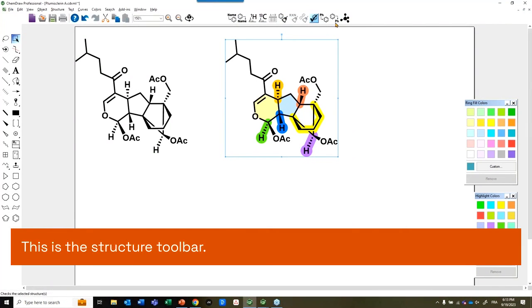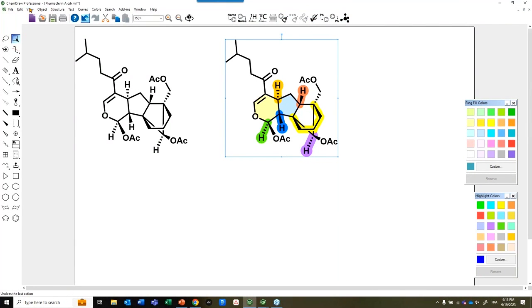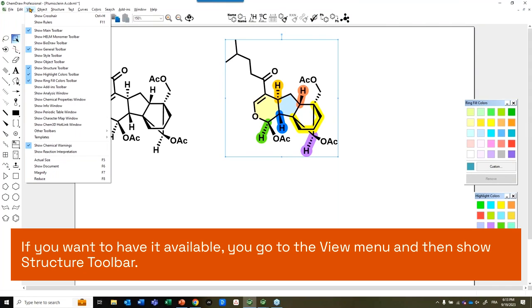So this is the Structure Toolbar. If you want to have it available, you go to the View menu and then Show Structure Toolbar.